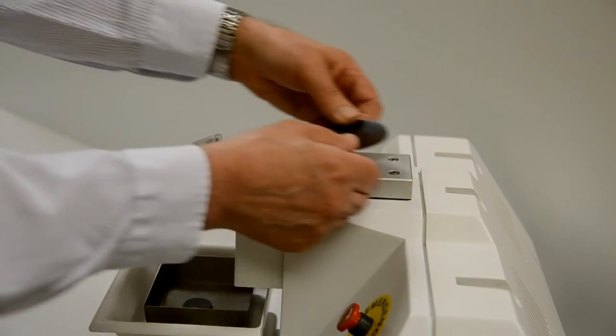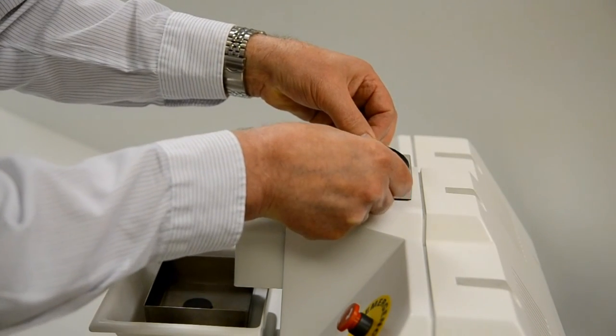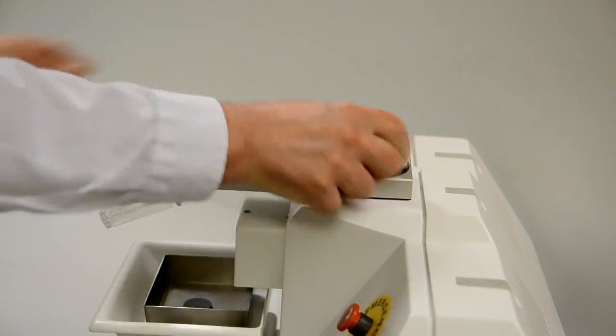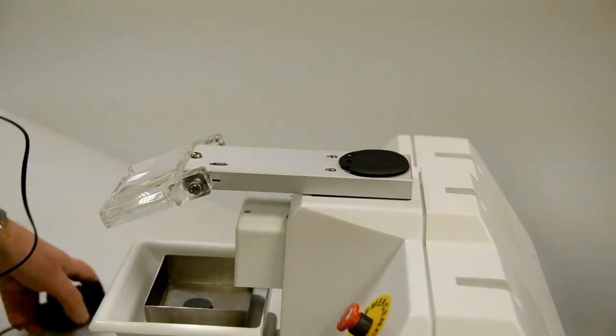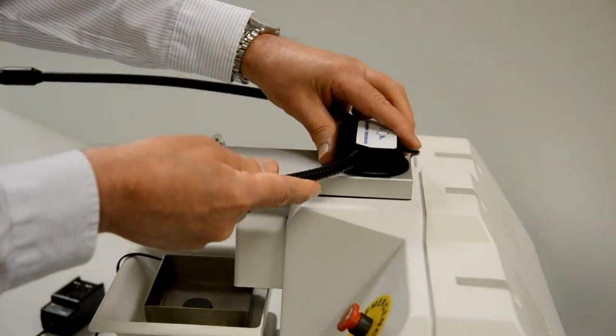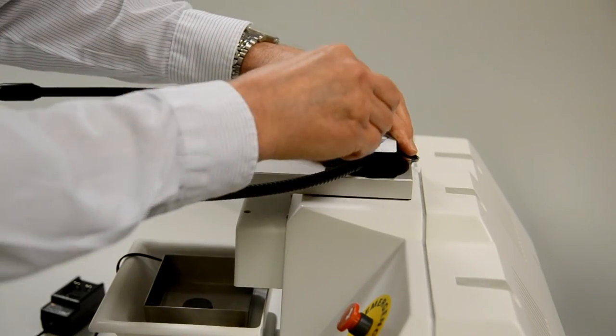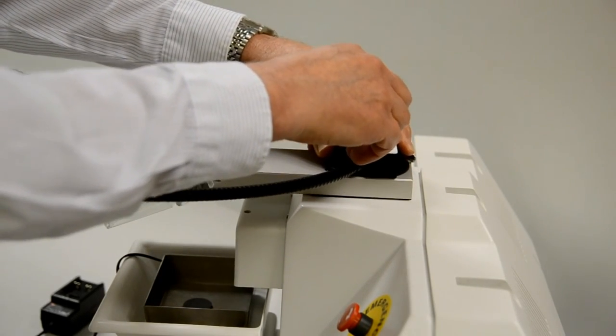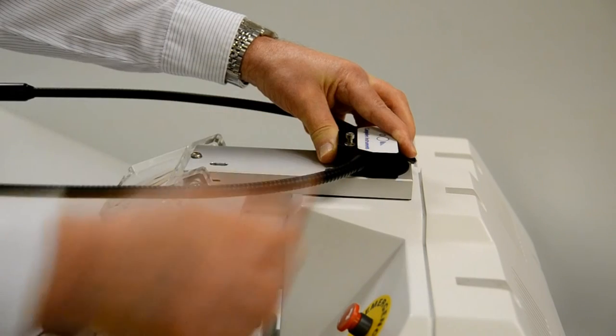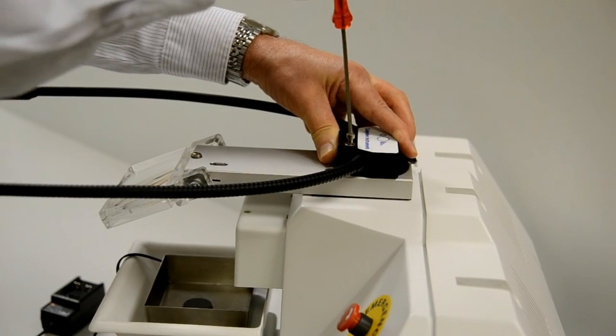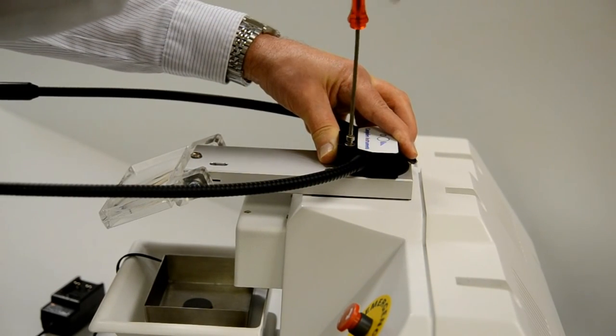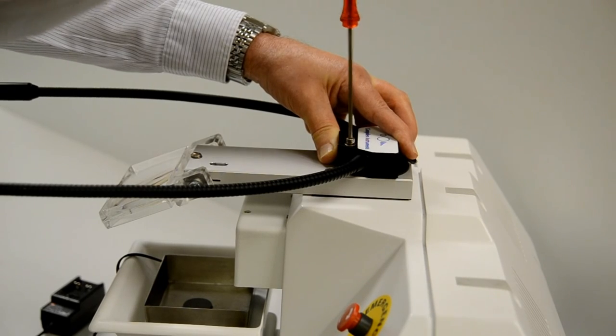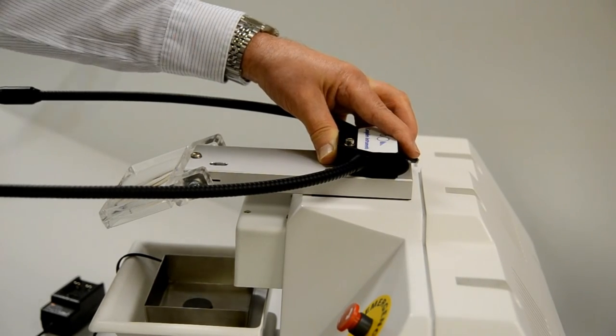A cold light source having twin flexible arms and focusable light beams is also available. This will give enhanced illumination of the tissue bath and tissue without radiating unwanted heat. This also fits to the slicer using the supplied neoprene cushioning pad and screws.